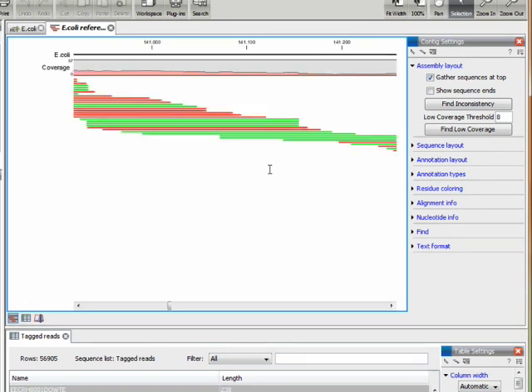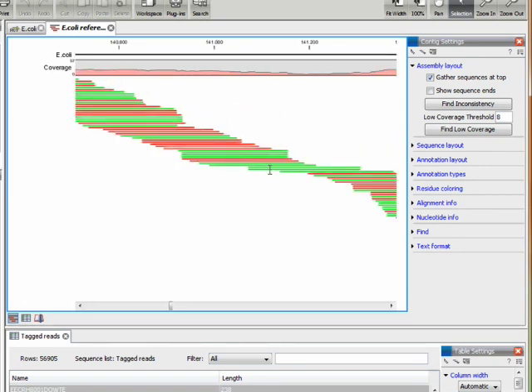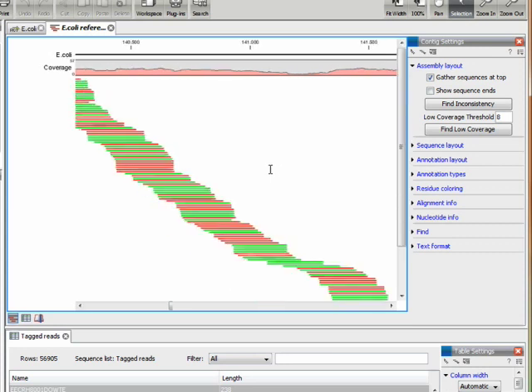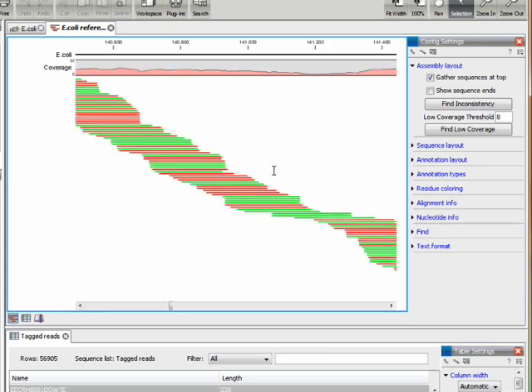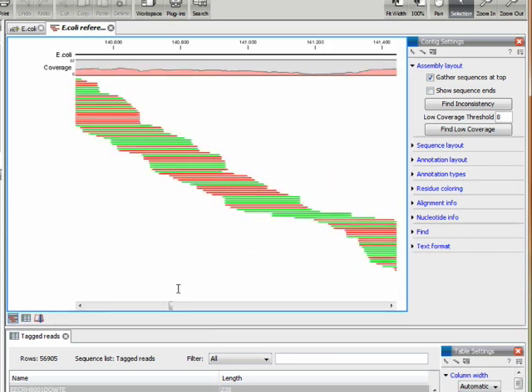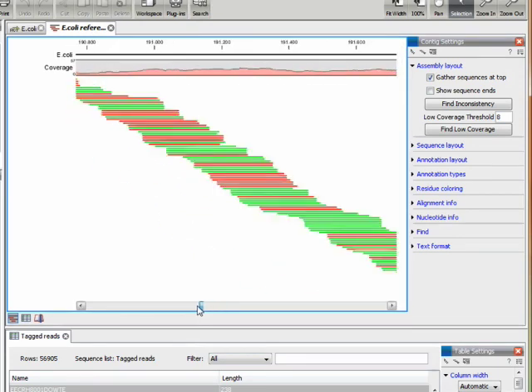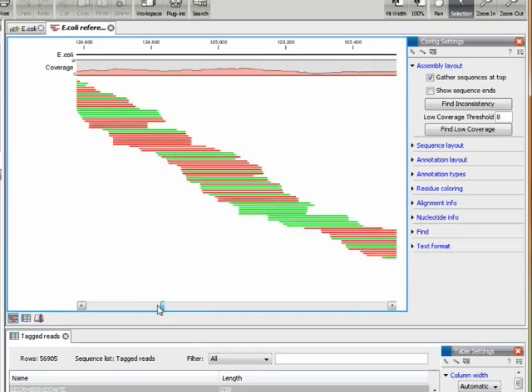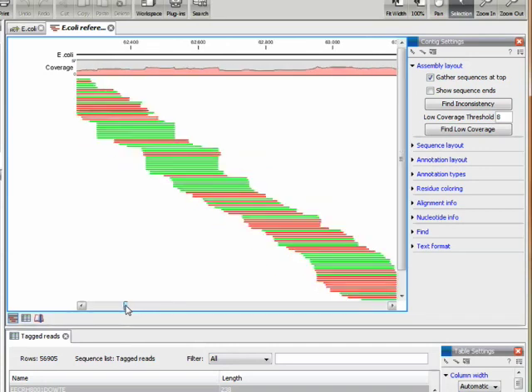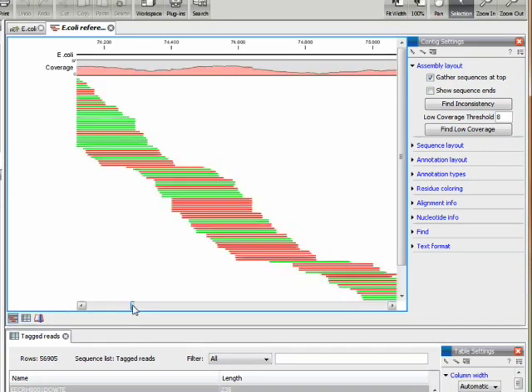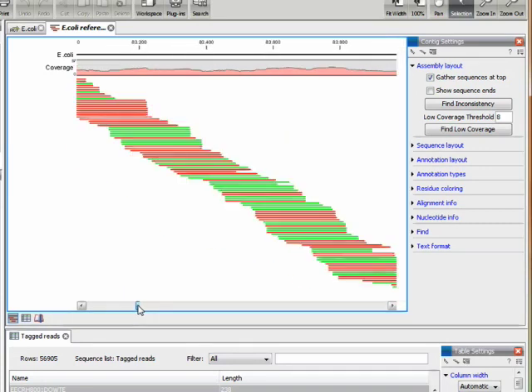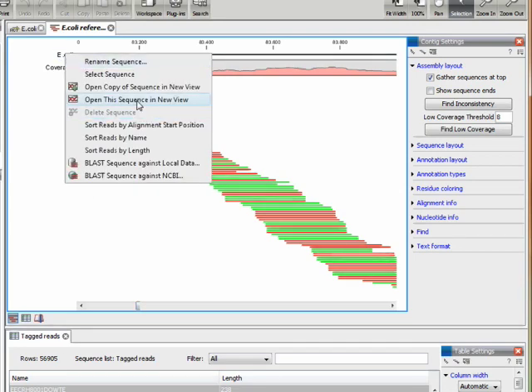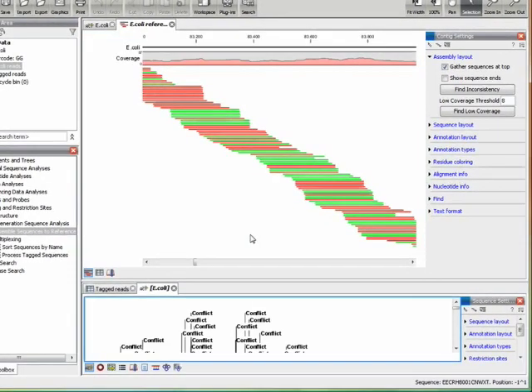We can change the side panel settings to show another view of the assembly. What we see here is, again, the reads in green and red, now just with a bar instead of the symbols. Now one can inspect larger portions of the assembly object at a glance, and we can show this together with the reference sequence.